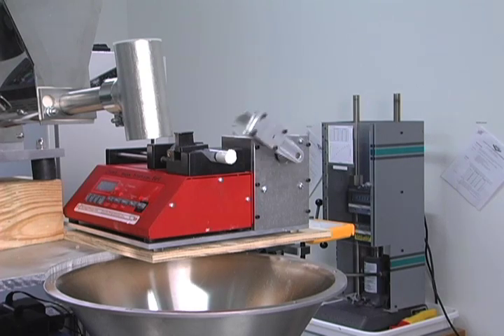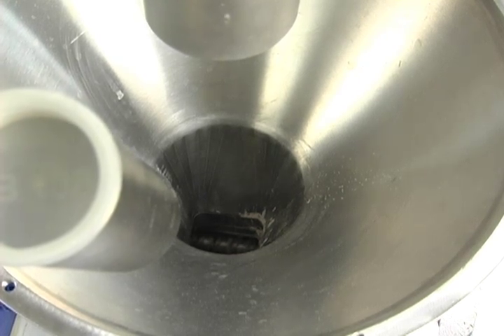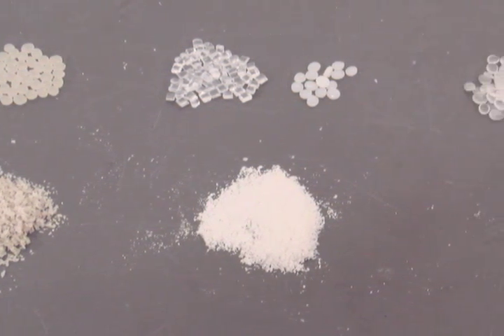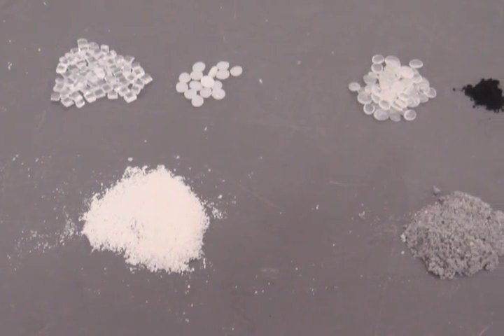Inside the barrels, material experiences significant levels of shear and compression, which can lead to fragmentation and fusion steps. Depending on the processing parameters and the type of materials, different phenomena such as chain scission of polymers, block copolymer formation between different polymers, and exfoliation and dispersion of nanofillers can occur.